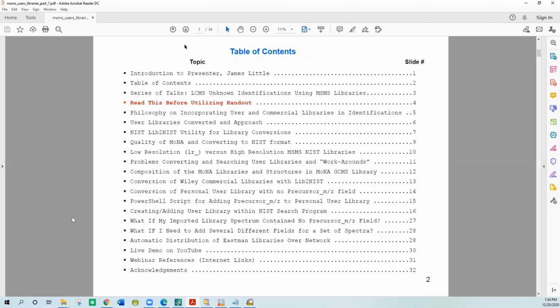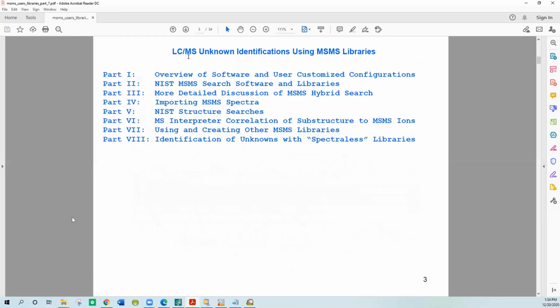With every one of the sessions that I created, there's a table of contents and a very detailed handout that tells one how to use all of the things that I demonstrate in the video and more. So you really need to read this to actually do it. The video is just to give you an idea of some of the concepts. And this is part of an 8-part series that teaches you how to use the software, how to do structure searches, etc. So take a look at the other ones. I think they'll be very useful to you if you like to do unknown identification using LCMS data.